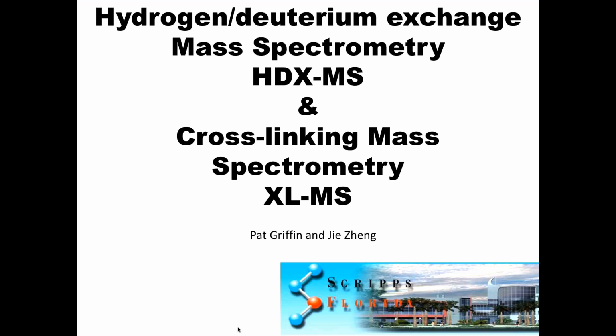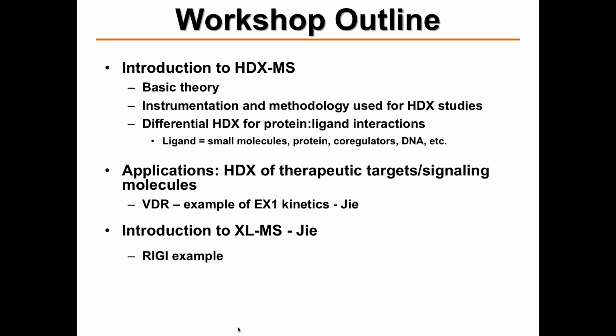So the outline for this part of the workshop: first, I thought it would be useful to go through some basic theory, an introduction to HDX. Then we'll talk about the instrumentation and methodology used for these types of studies, and then the concept of differential HDX, which is mostly what we've been doing within the Hive, looking at either protein-protein interactions or protein-ligand interactions.